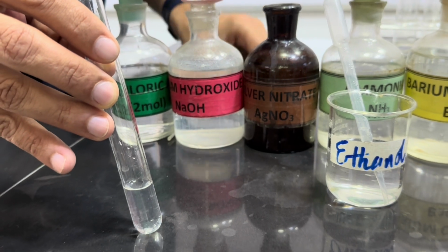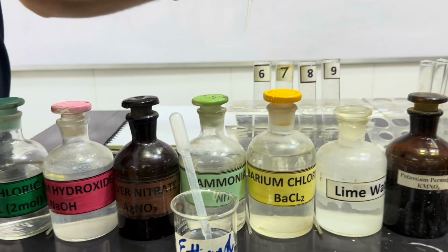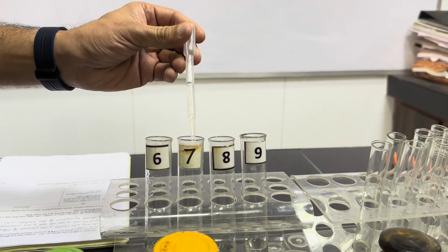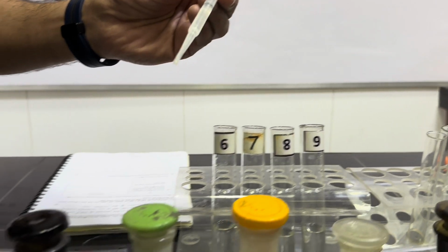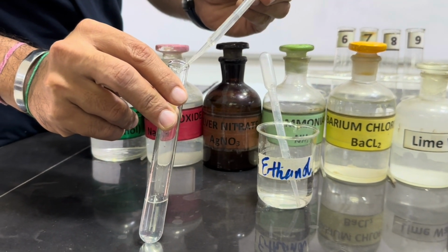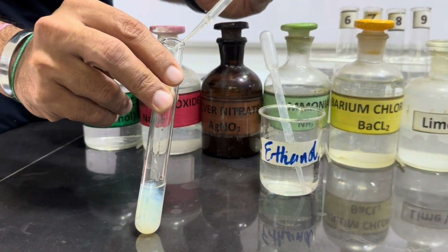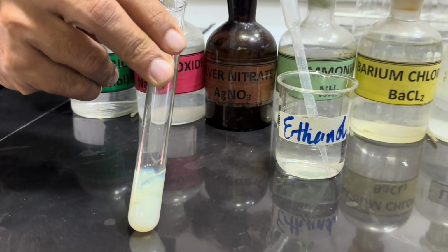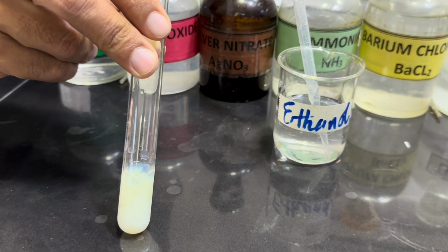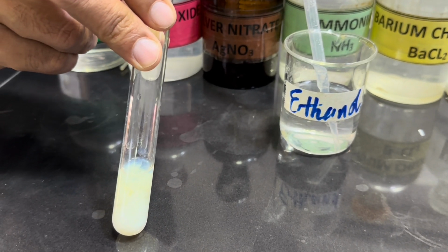Now we will add 10 drops of FB7. So here is our FB7, and now we will add 10 drops here. So 1, 2, 3, 4, 5, 6, 7, 8, 9, 10. And we can see very dense yellow precipitates are formed.